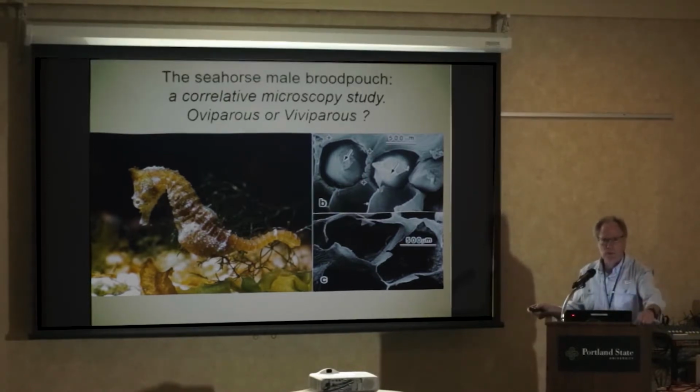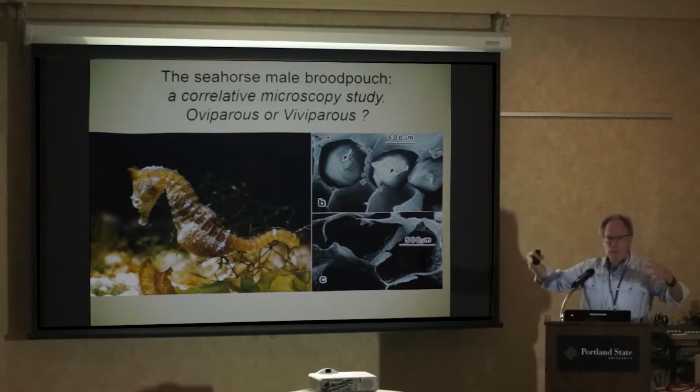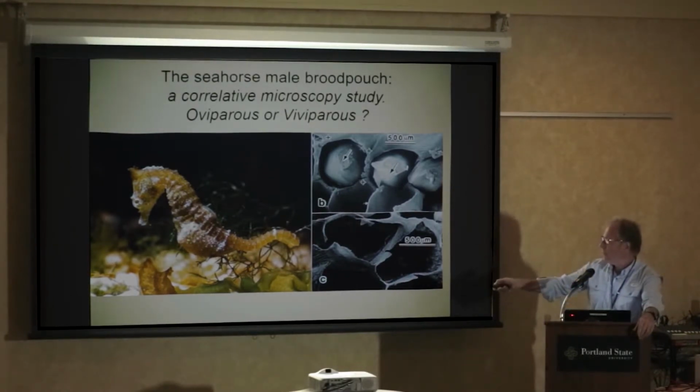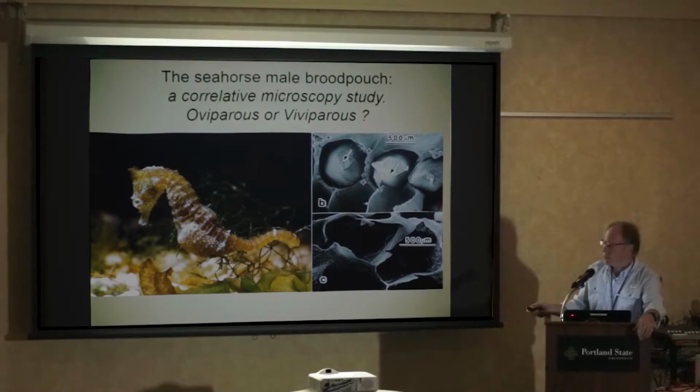You can set up your camera for time lapse and maybe get some of those images. Getting this, I don't want to hurt that little guy. It's about to give birth, for heaven's sake. I don't want to cut the head off. So I go into the museum, and I can find museum pickled specimens that might go back to the 1920s that have a pouch distended like that, cut open a little flap of pouch, take a little flap of the tissue, and start working on it with electron microscopy, which is mostly what I do.